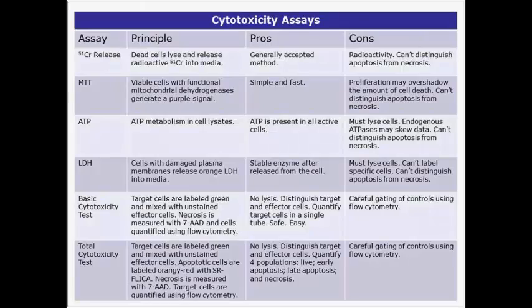Here are some assays that have been used to determine cytotoxicity. The top four are basic assays that will generate simple live/dead data as general indicators of cellular metabolism. They typically measure the release or reaction of an enzyme or metabolite. However, these reagents may be leaky and often require cells to be lysed.